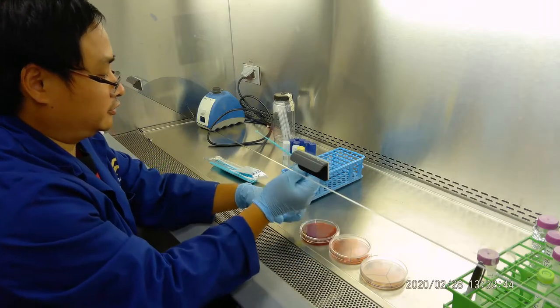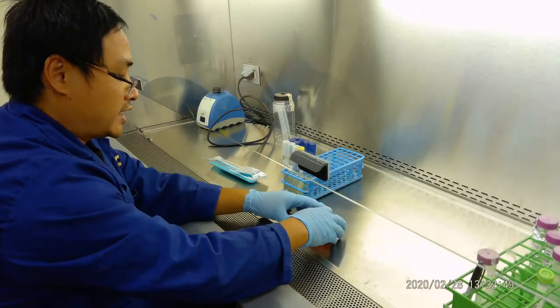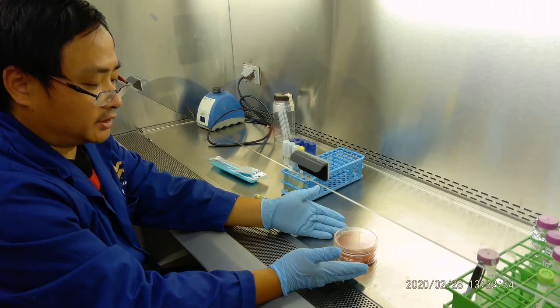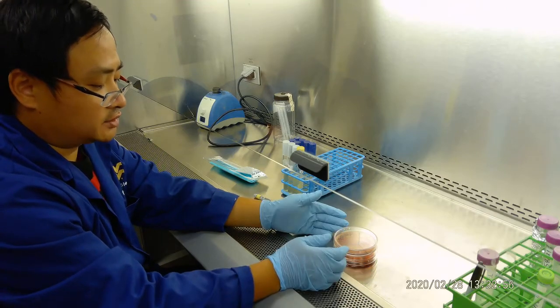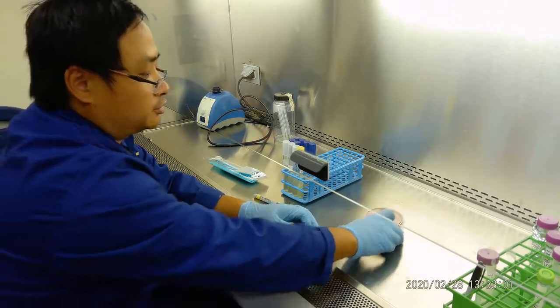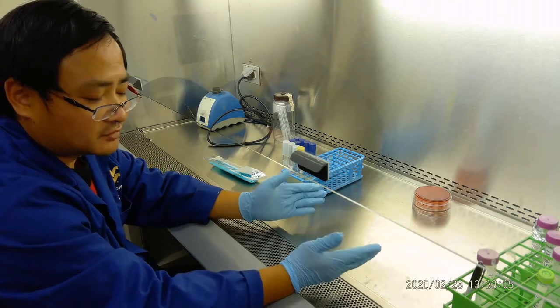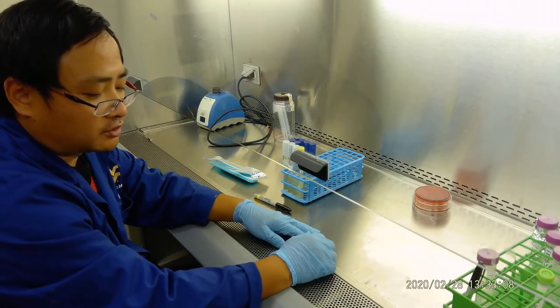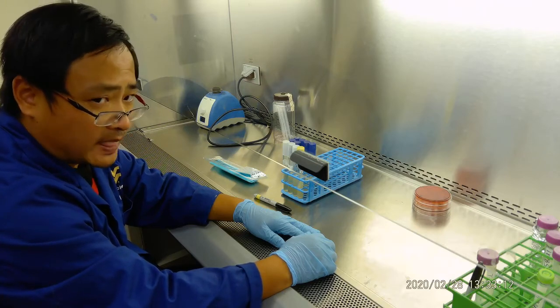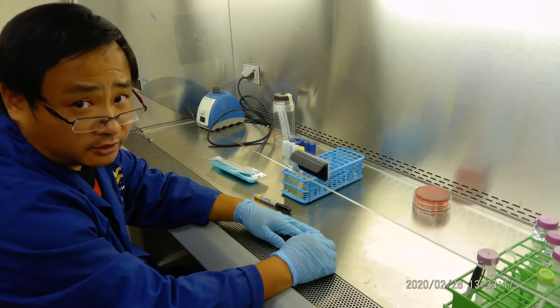Okay. Now after doing this, it's very simple. All of these we have to stack, leave at room temperature a little bit, about 3 to 5 minutes. Then we flip it over to do the incubation. We want to see their growth status after 24 hours at 35 degrees Celsius. Especially we want to see whether they grow or not grow, and their morphology. Also we want to see beta and alpha hemolytic.